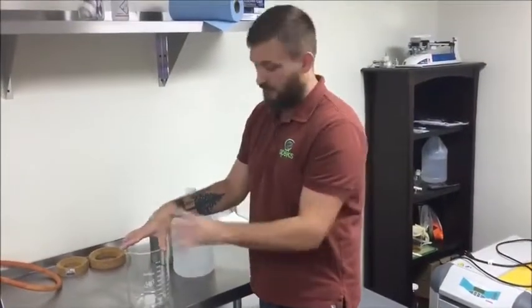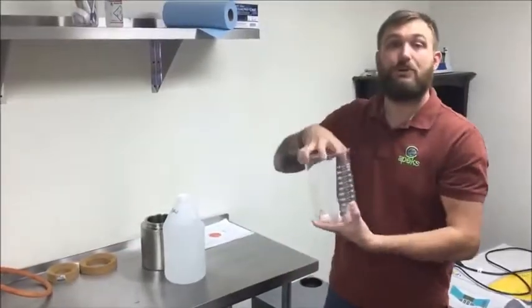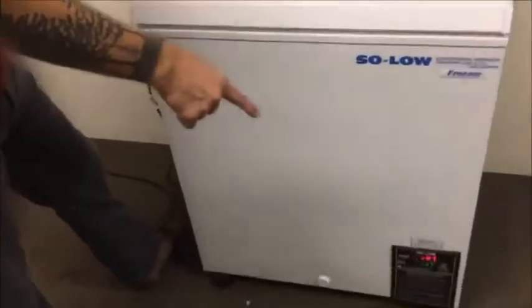and then I'd cover this. We have our ethanol and our extract all in solution. We're going to then take this and put it into our lab freezer. Here's our freezer. We're down at -47°C.